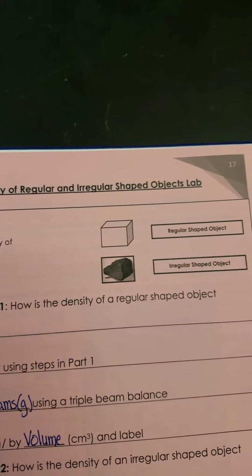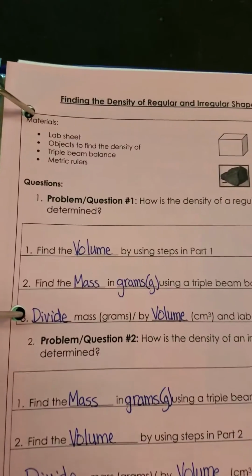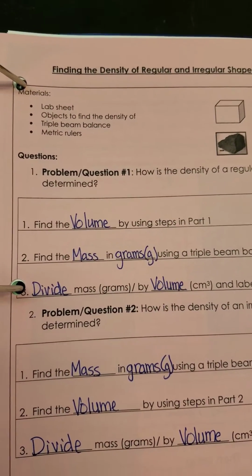Okay, so this is going to be the Finding the Density of Regular and Irregular Shaped Objects lab. So this is part 1. First, you're going to need to fill in some of your blanks.